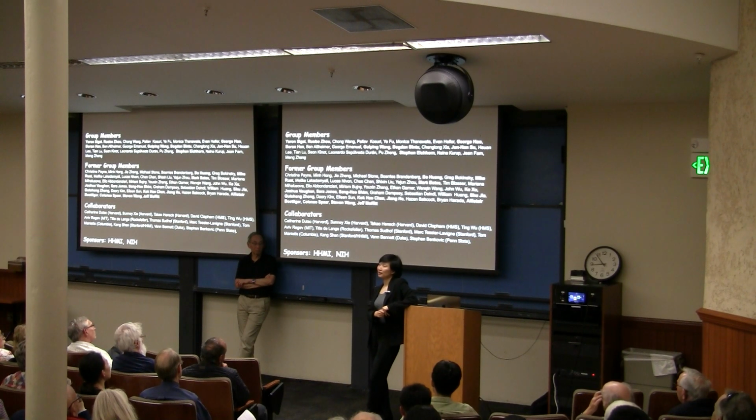So very often, a lot of the biological processes are revealed by light microscopy, because STORM is just another light microscopy approach. So the penetration depth issue is the same, okay? So was that answered, was that clarified?